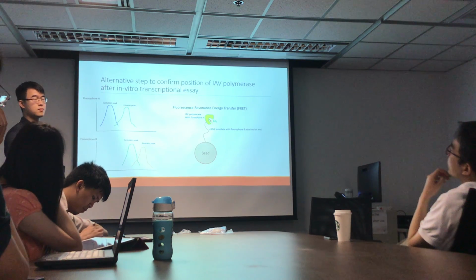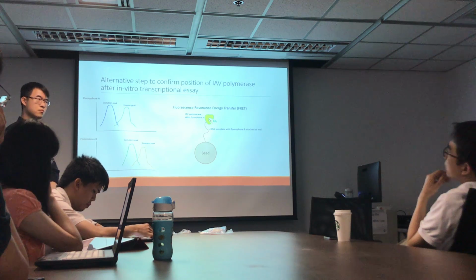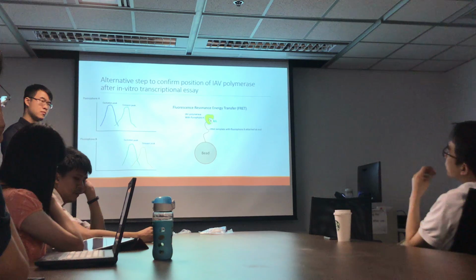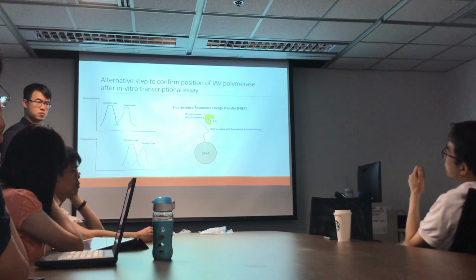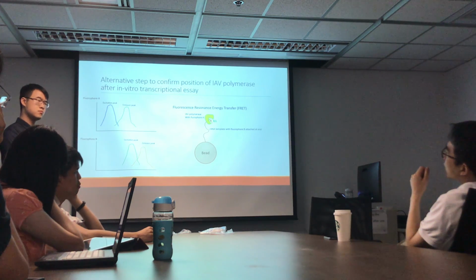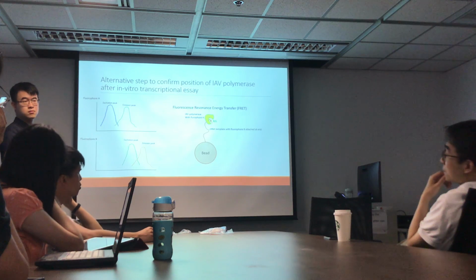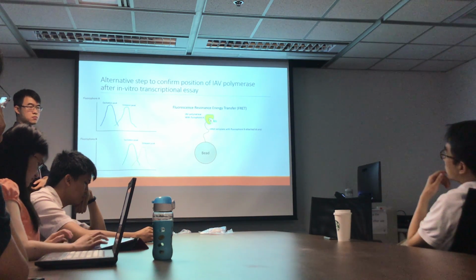I think in our department, Professor Guo probably has one stop flow, but they use a UV detector. With UV, you mean a UV excitation beam? UV absorption, the detector, I think. We can use UV fluorophores too. That's what they normally do; fluorescence could be a choice too.